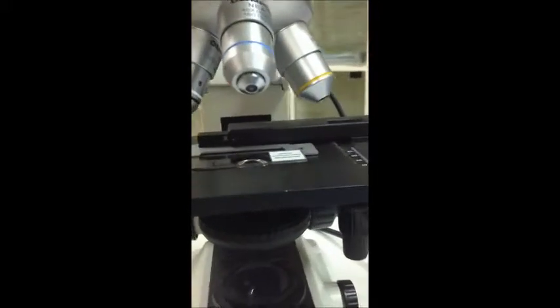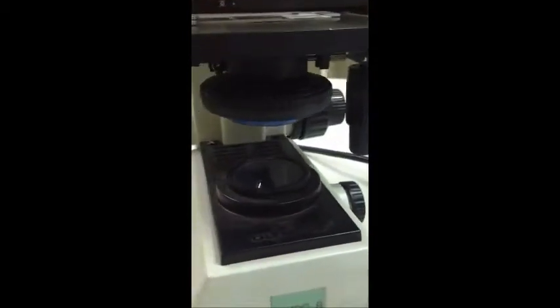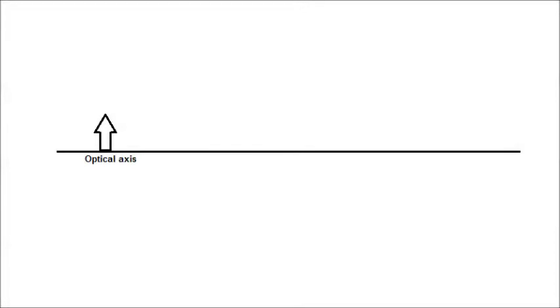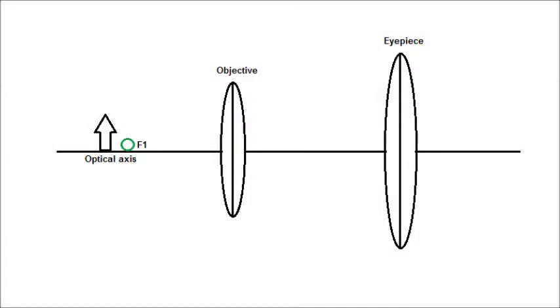A basic microscope is made up of two converging lenses. One reason for using two lenses rather than just one is that it's easier to get higher magnification. If you want an overall magnification of 35, for instance, you can use one lens to magnify by a factor of 5 and the second by a factor of 7. This is generally easier to do than to get a magnification of 35 out of a single lens.